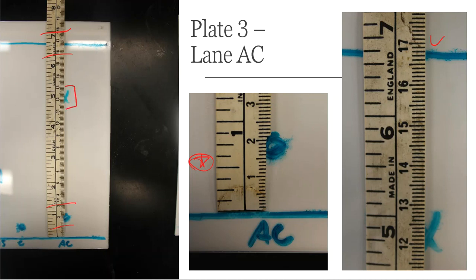Notice this marking here. That's not a mark. That's not a spot. All right. I wrote the word mix, and this is the X of the word mix that I wrote onto the plate. So this is nothing. I want you to forget about that. That is not a smudge. It's not a spot. Nothing showed up in that area. That was just a part of the X from the word that I wrote onto the plate to label it.